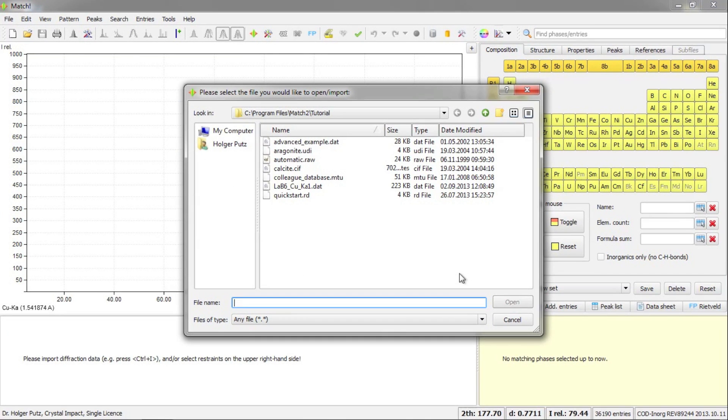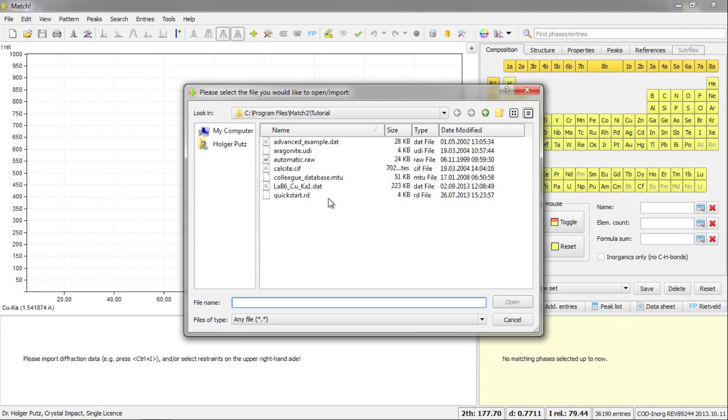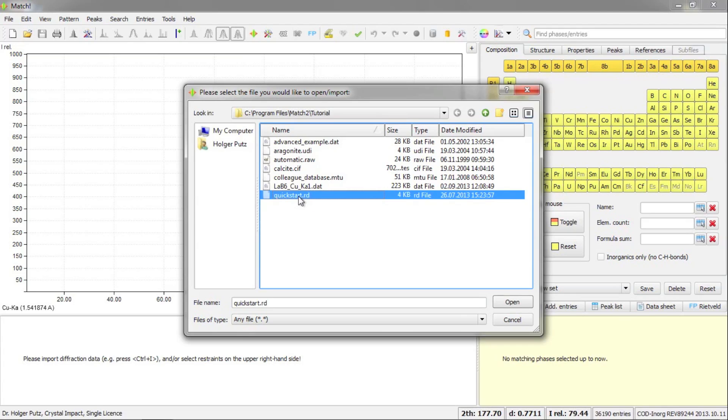The first action it takes is to ask you to import the raw diffraction data you would like to process and analyze. This is the contents of the tutorial subfolder of the Match program directory and this contains some examples using which you can learn how to run the software. We will import this file quickstart.rd and press open.